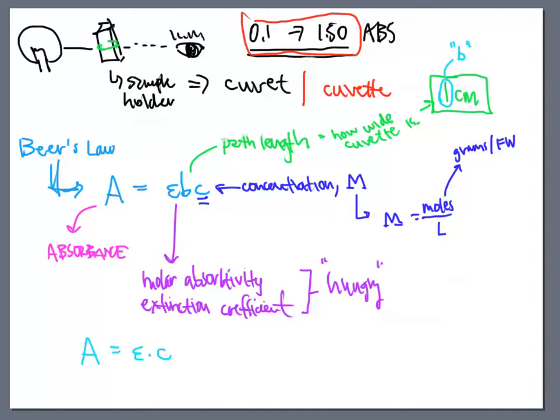So that's our molar absorptivity number. How hungry they are, or how much light they absorb based on certain criteria. The criteria here I don't want to go into. That's a little bit more advanced, right? If we can just accept the idea of molar absorptivity, we'll be okay. This molar absorptivity value, or the extinction coefficient, is a constant.